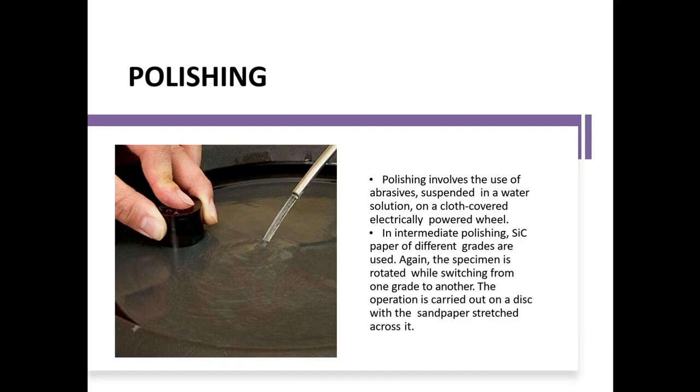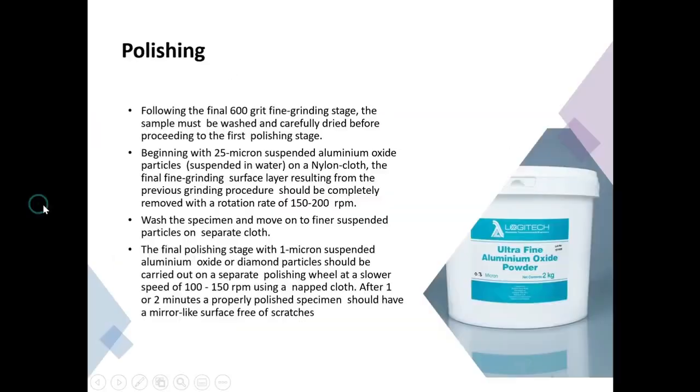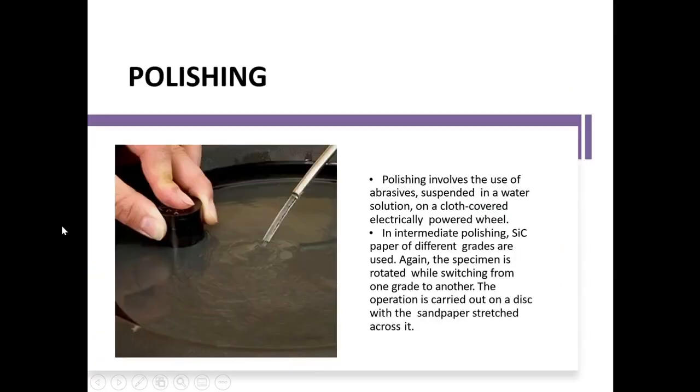So if you consider this is a workpiece, in order to generate a smooth and shiny surface, it has to be rubbed on a smooth cloth, leaving the surface with significant specular reflections.